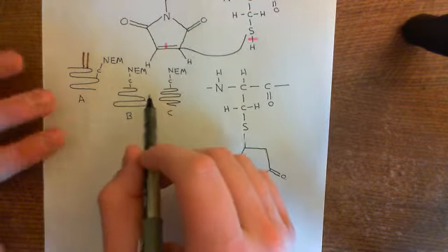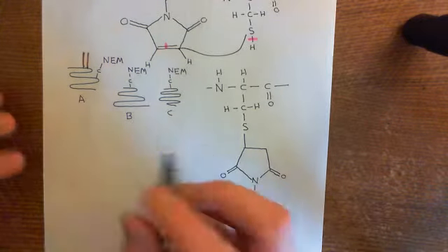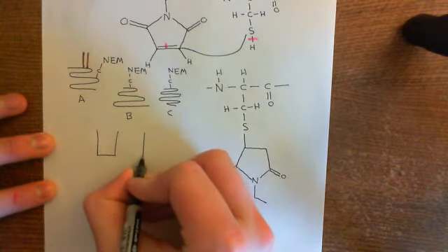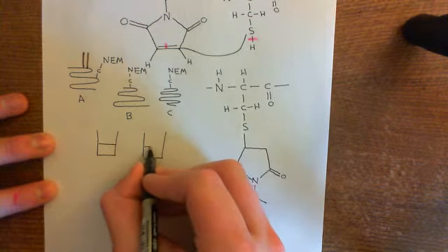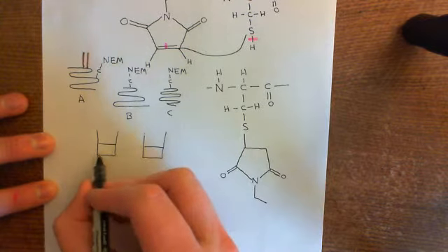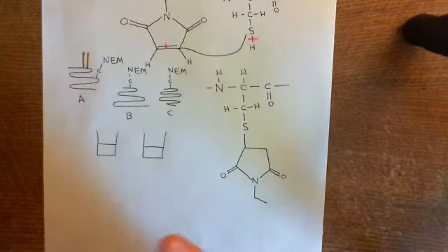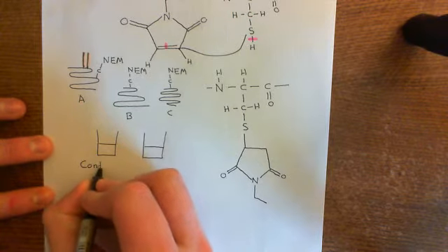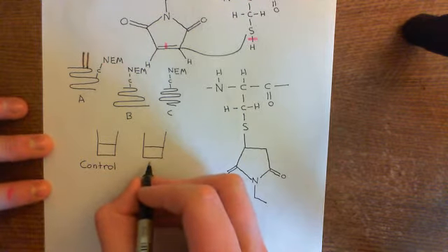So it's not as though I'm going to put the A and the B into one and then the C into the other. No, for both of the samples that I'm producing, I'm just literally pouring our test tube into 2 test tubes, and both of these new test tubes will get A, B, and C molecules in. So this will have loads of A, B, and C molecules in, and this will have loads of A, B, and C molecules in. Now, they're going to go down different routes. One is going to be our control, and you'll see later why we need a control. And the other, we're actually going to do something to it.